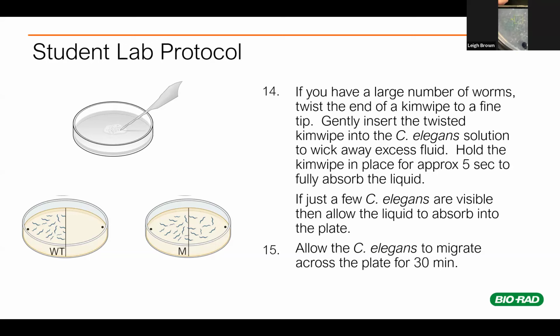But I do have people that will keep their worms year to year by just subculturing them. So they'll just pour extra plates, and then every couple months, just take some of that agar and move it to another plate and then let them regrow.